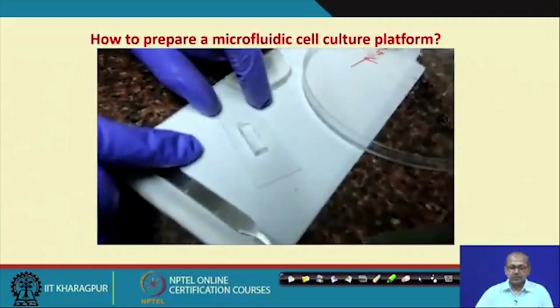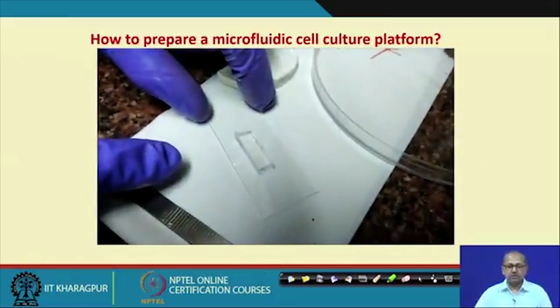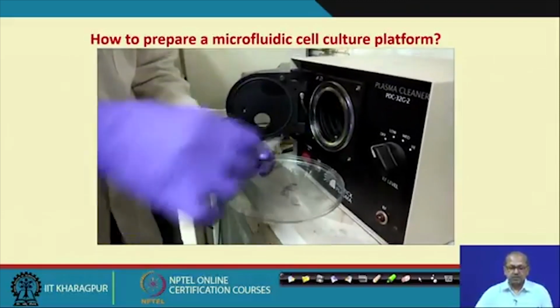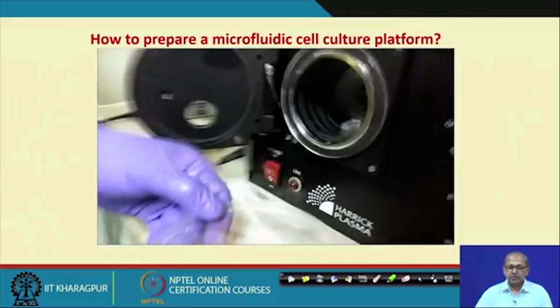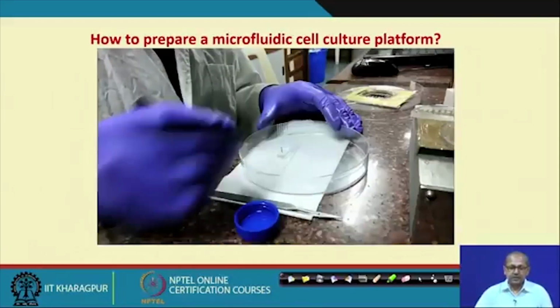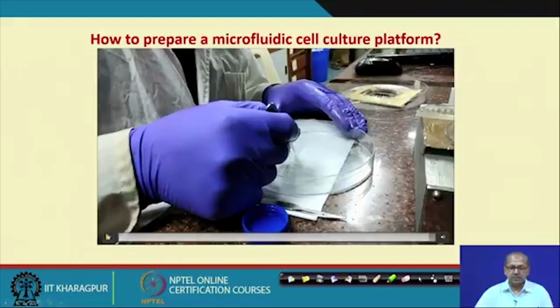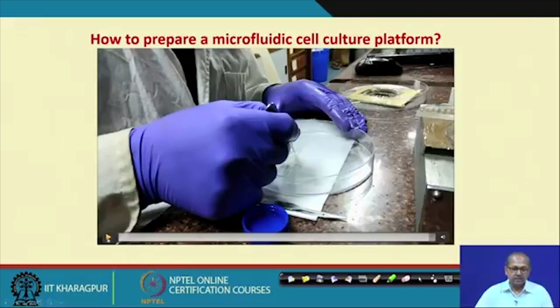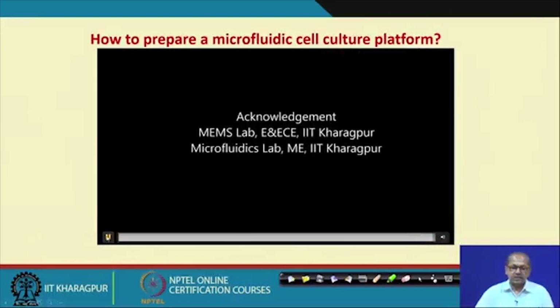Now, the next step is plasma treatment, by which it will be bonded to your glass surface. So, that is plasma bonding. We insert the glass slide and the PDMS, with the channel side on top, then expose for the desired time. After that, you take the plasma-treated surfaces and properly align them so that the exposed surfaces come together. Then you put some PDMS on the sides to seal, bake it again, then you can punch it and get the structures.